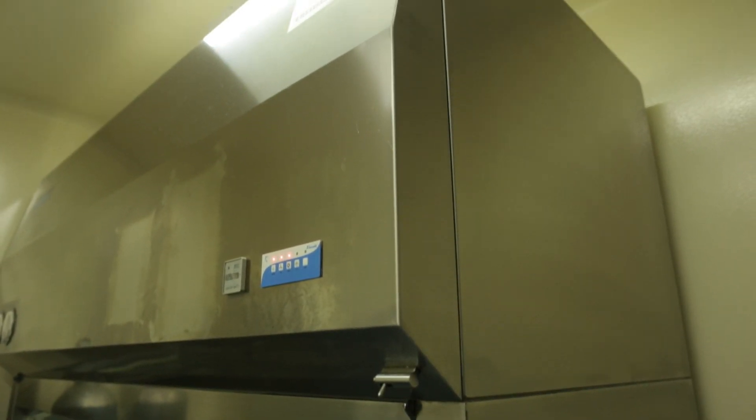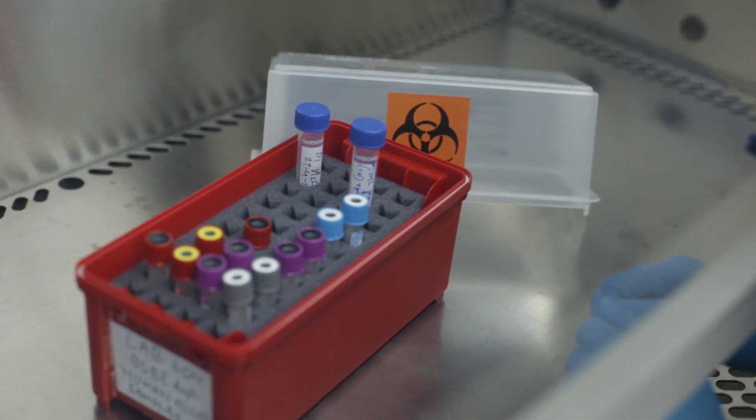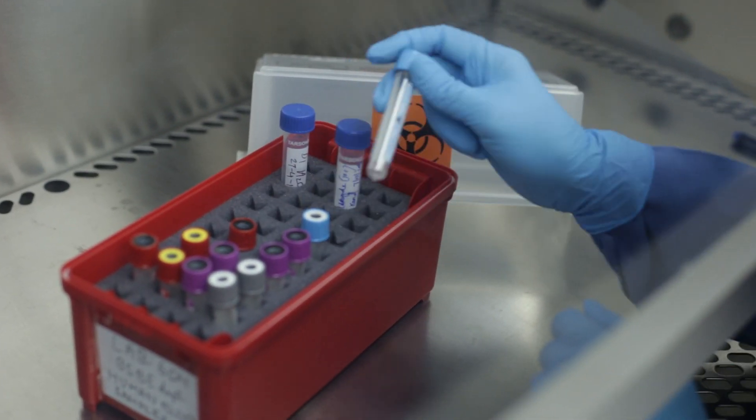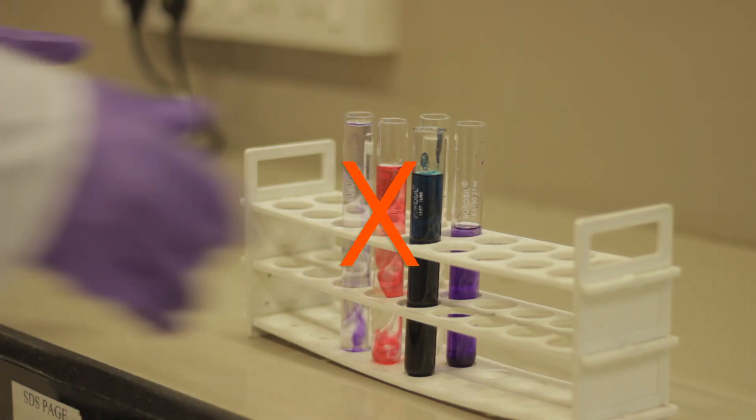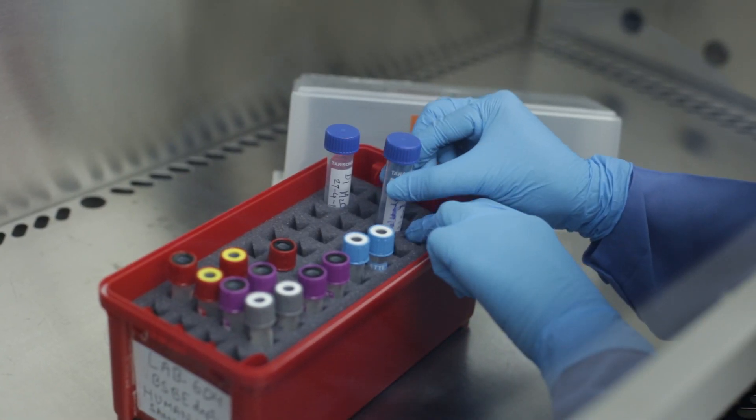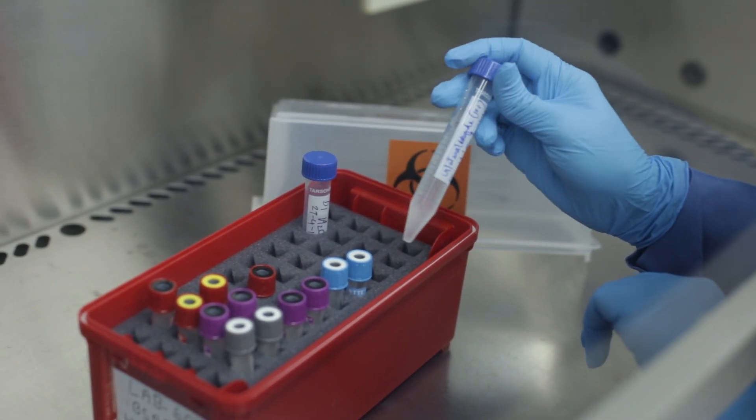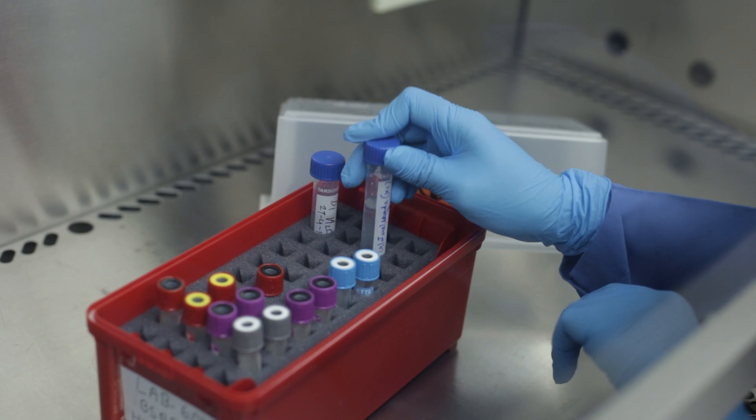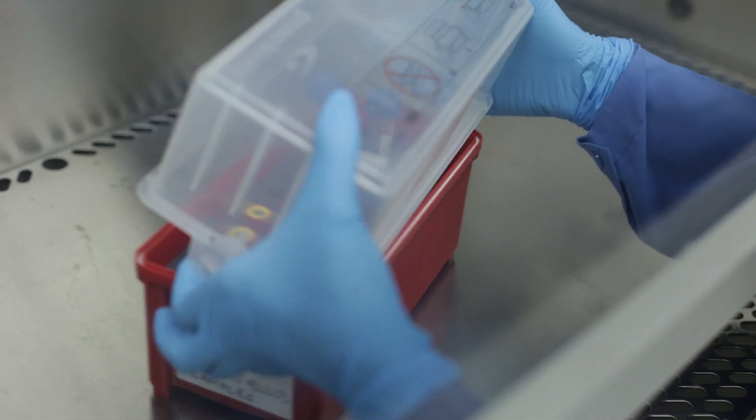Improper methods used in transportation of biospecimens between laboratories can cause spills and contamination. Screw-capped tubes must be used as primary containers. Glass tubes must not be used for transporting specimens. Labels must be affixed on primary containers.